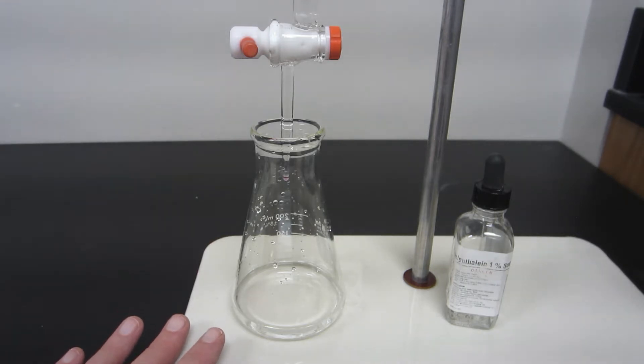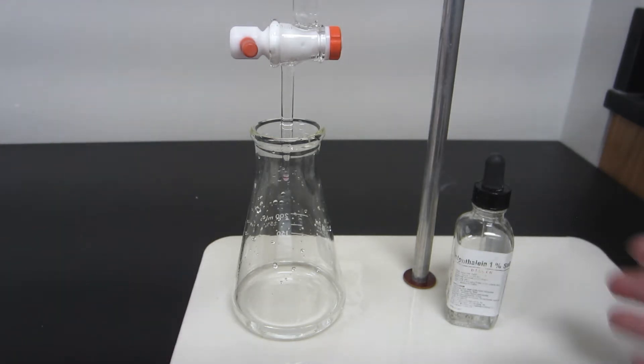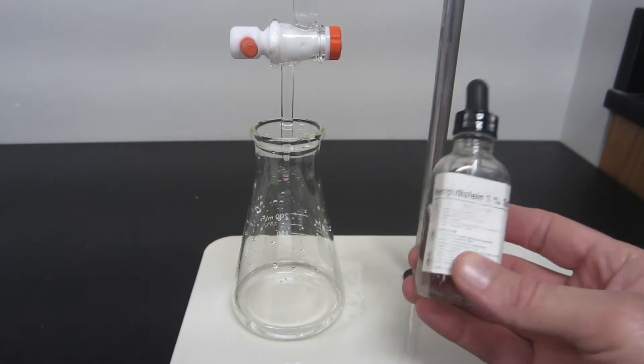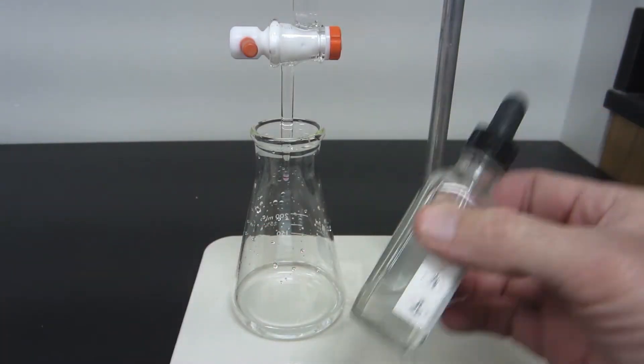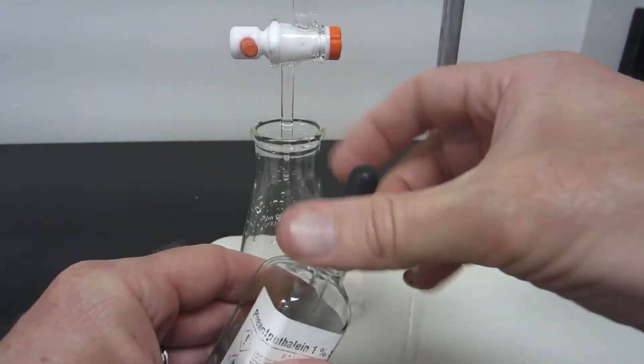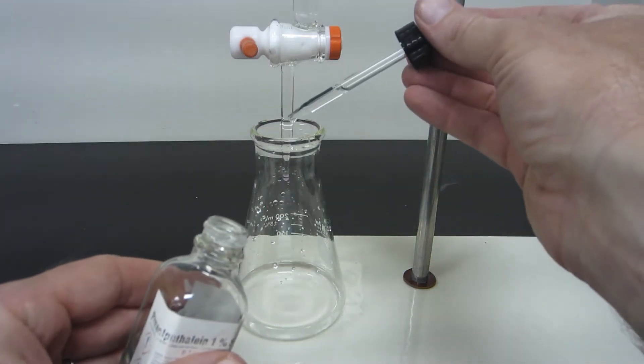The burette is ready to go, so it has that measurement that you just saw a second ago. Before we start, we're going to use an indicator called phenolphthalein. You can see it's just a clear colorless solution, and this molecule, you only need a couple drops in there.